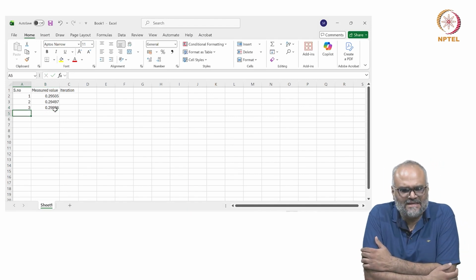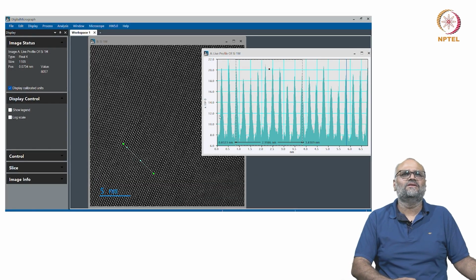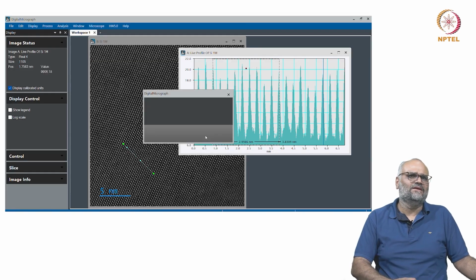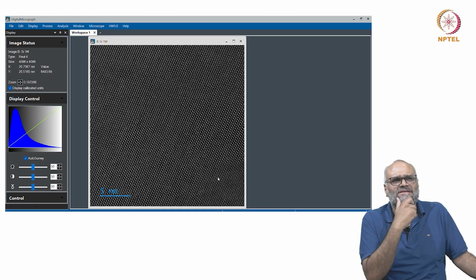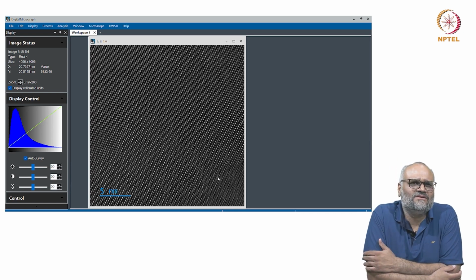So as you can see, I'm getting quite different numbers using the same kind of a line and using a width or not using a width for the line profile here. And usually when you're starting new on the analysis and you're asked to analyze high resolution micrographs like this, it is common that you start doing such an error.